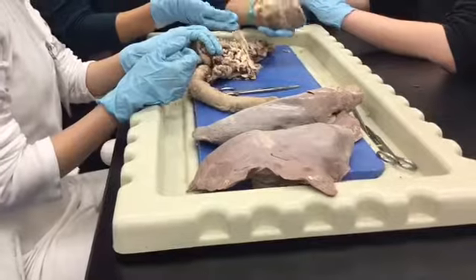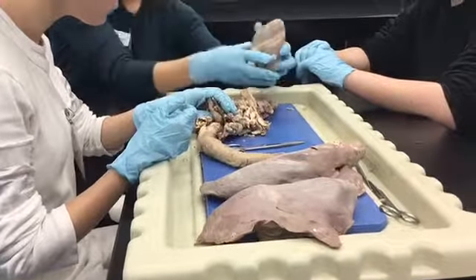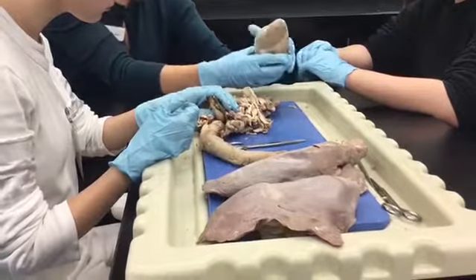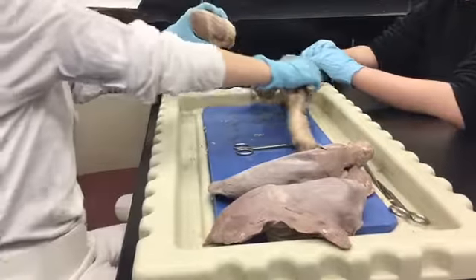Alright, so this is your heart. And when you guys are dissecting, you're just going to want to cut down the sides of it. So when you're looking at it, you'll cut down and you'll half it. Okay. Sure. Can we do that now? Yep, you can go ahead and do that now.